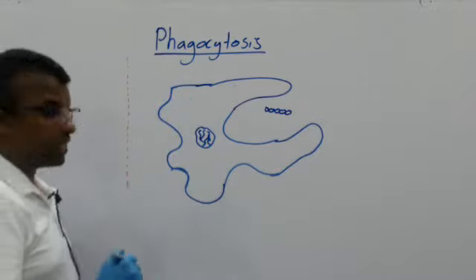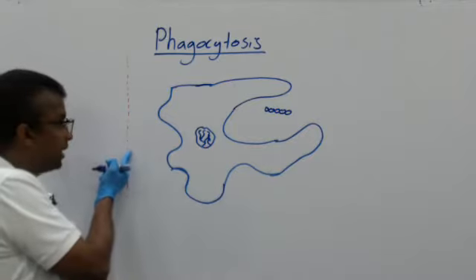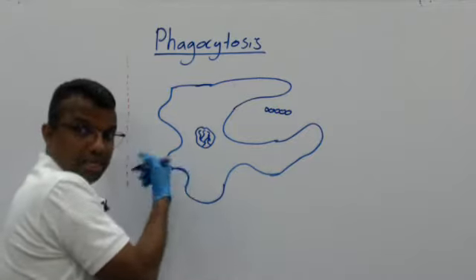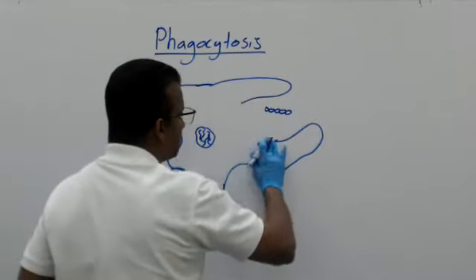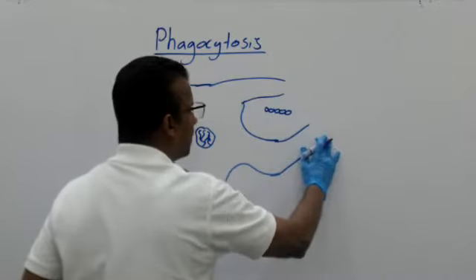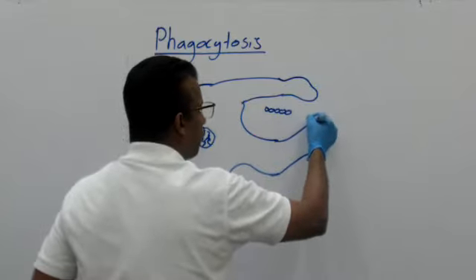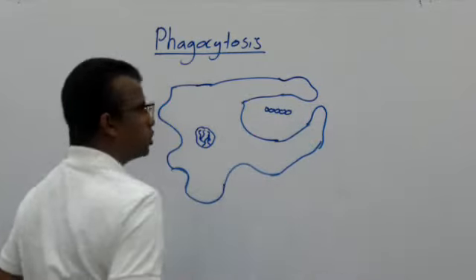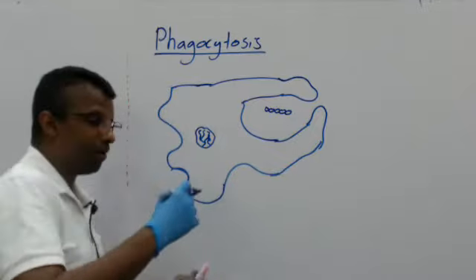So what you will see now is, initially the amoeba was near this red line. Now the amoeba is here. It has moved slowly. And what happens is, the amoeba's shape continues to change, whereby the pseudopodia is slowly trapping the food, engulfing it.